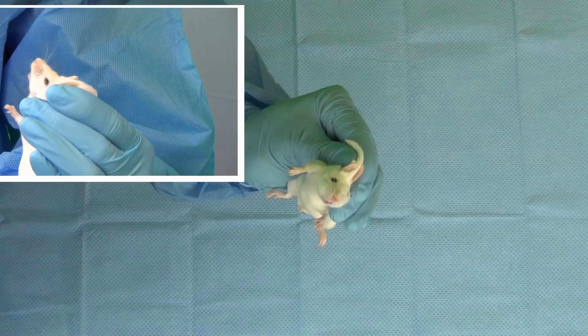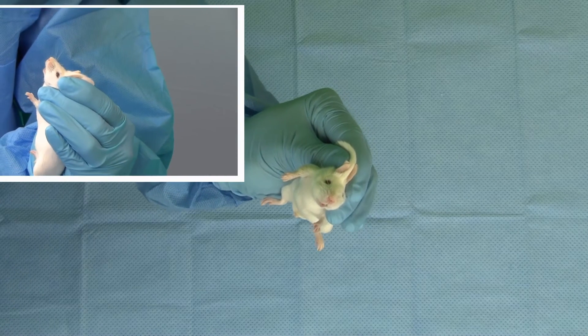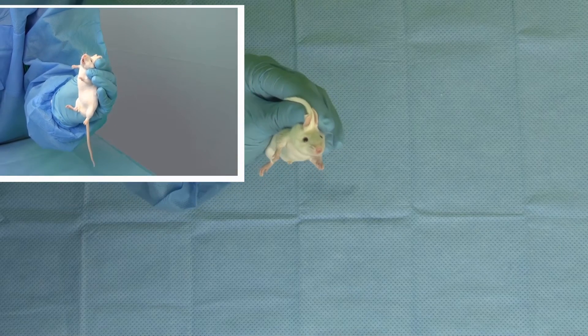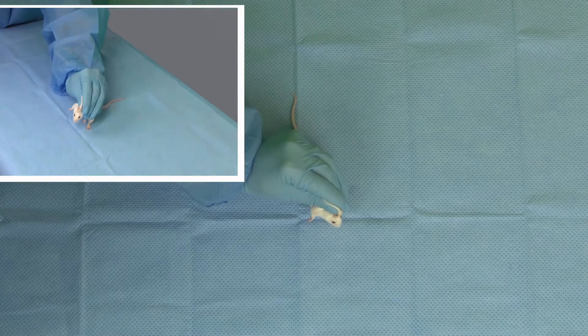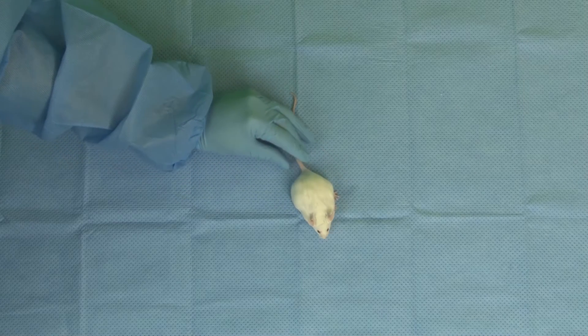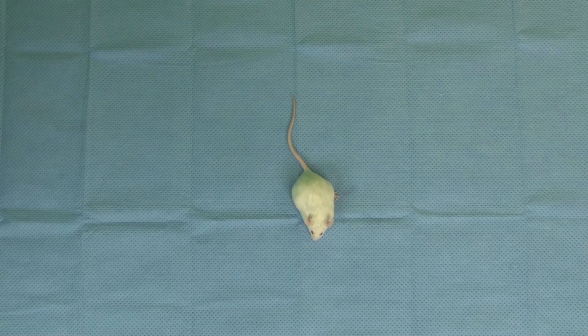Little to no resistance should be encountered, as resistance can be an indicator that the tube has entered the trachea. In addition, administration should stop immediately if fluid is noted bubbling from the nose. This is an indicator of aspiration.